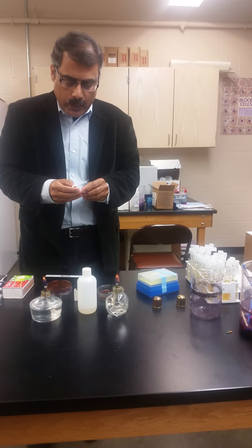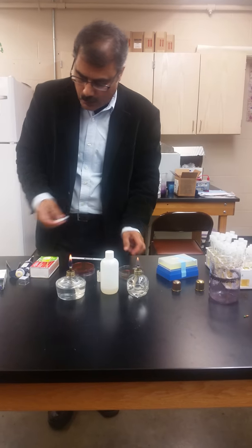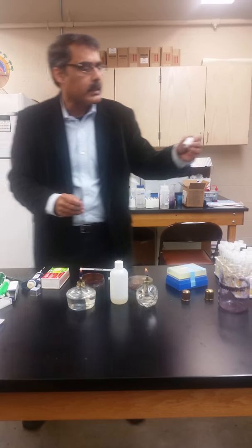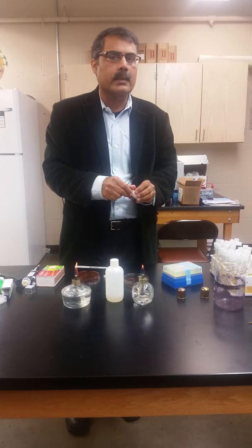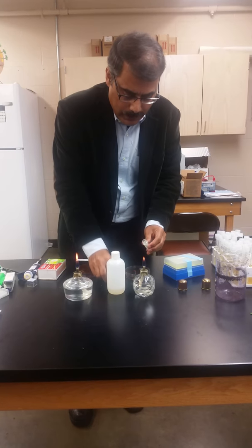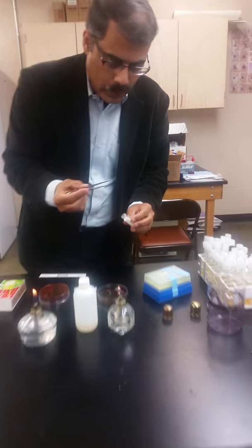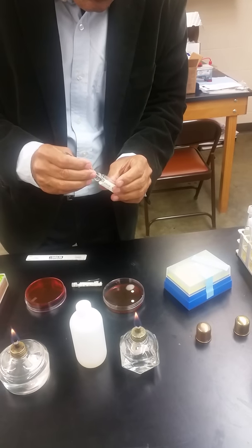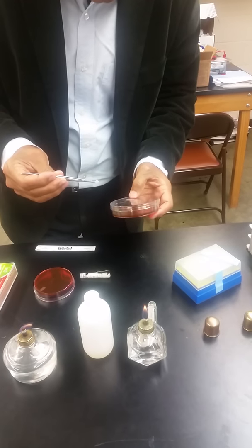And so we can try 3 different ones here, and then a control. So let me just quickly show you the control. Controls are these which have no drug on them. But you have to just treat them as sterilely as possible. So clean forceps, go in here and collect one of those and put it where you said control.